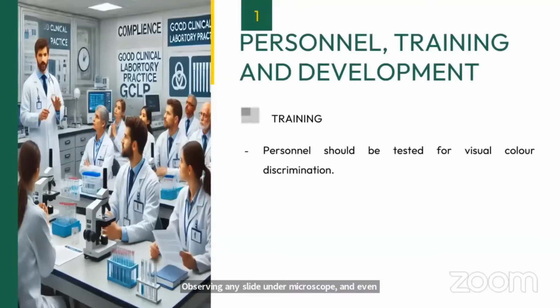So for that purpose, the person who is doing this screening or who is doing this microscopy, they should check their visual color discrimination, because it is a very common disorder. Color blindness is a very common disorder. So in that case, and it generally goes unnoticed.